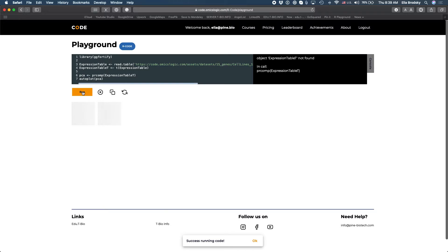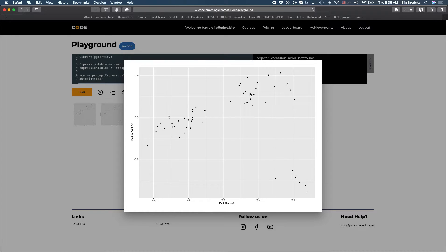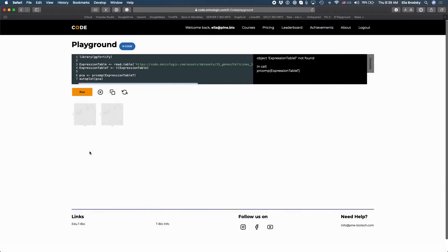All right success running code. Let's take a look at what we have. Interesting, now we have some groups that emerge from this principal component analysis. Let's color these so that we can see what they actually look like.